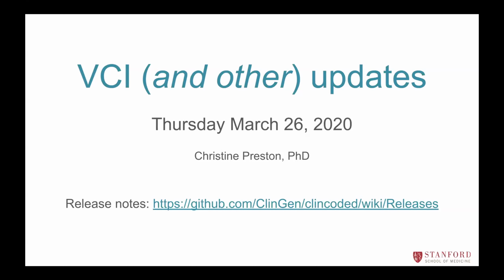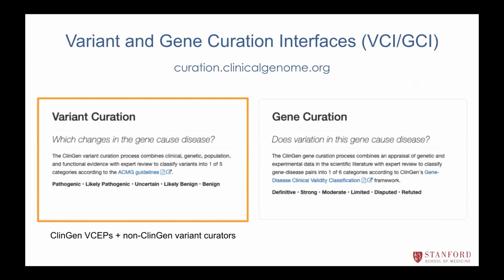And as Matt nicely mentioned, the gene curation GCI interface is primarily for ClinGen VCEPs, but the variant curation interface is a community curation tool for both ClinGen VCEPs and non-ClinGen variant curators and affiliations.